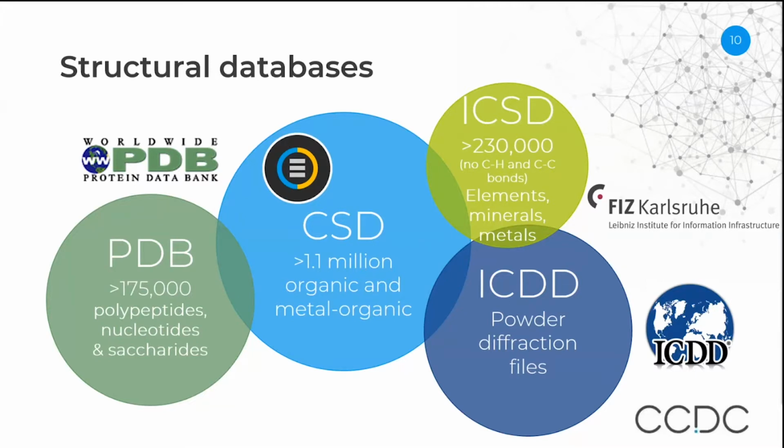For today, we're going to be focusing on the CSD, but the other relevant databases to our metal organic research are probably the ICSD and ICDD, so you might see a bit more information about those popping up along the way.